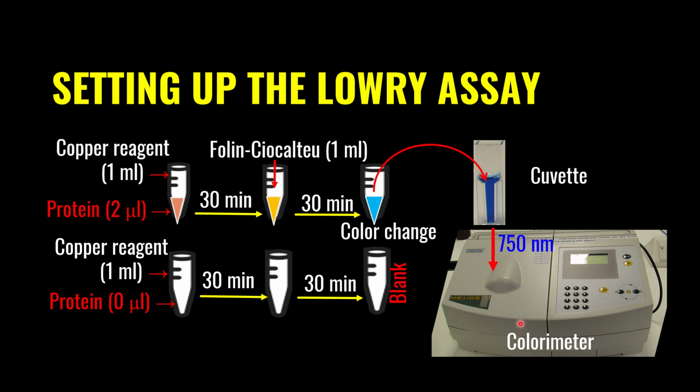So you will get optical density. What does this mean? How will you translate it into microgram? For that you have to have a standard curve, which we are going to prepare in the next slide.